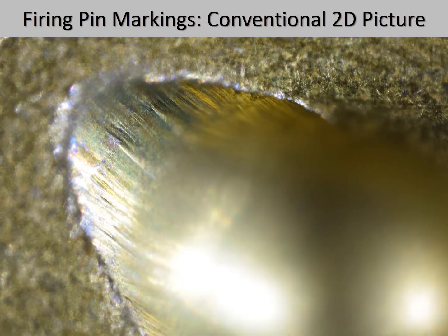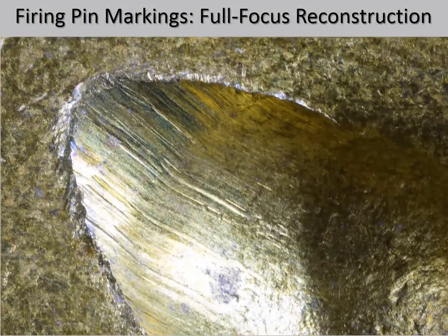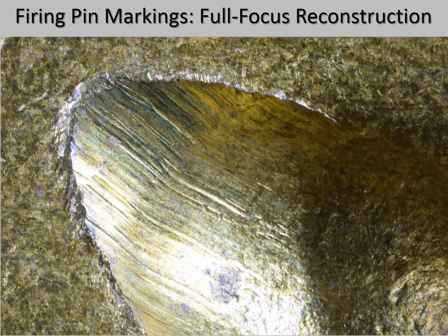Here is a closer two-dimensional view of the firing pin markings. We see that only a small portion of the markings are in focus. Now, with the EDGE 3D Microscope, we see a full focus reconstruction of the markings throughout the entire depth of the firing pin impression.